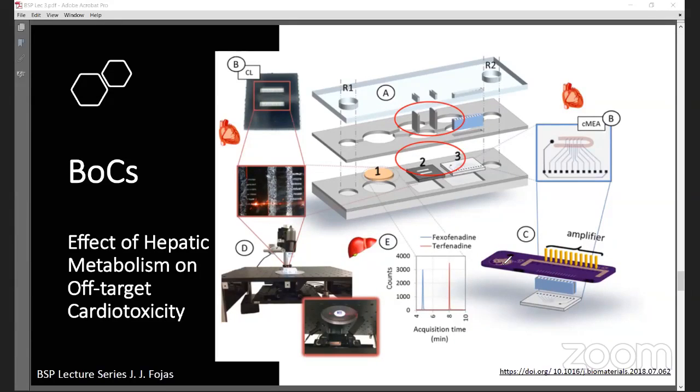In this particular study, they use customized microelectrode array chips, which they designed as 2 rows of 5 electrodes each. I think the electrodes were around 80 microns in diameter with 1,000 microns separation, for measuring your electrical activities.